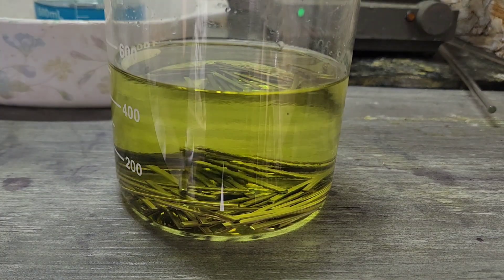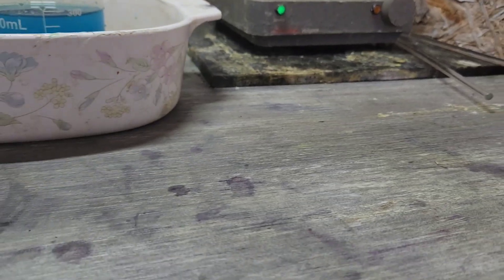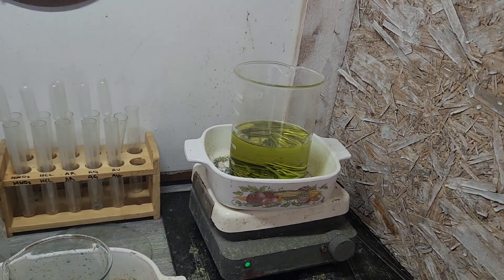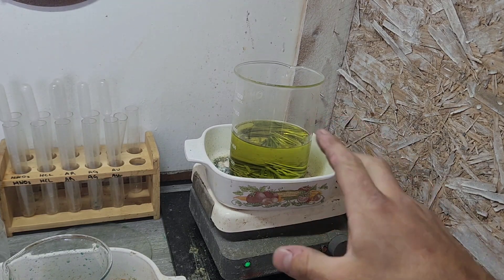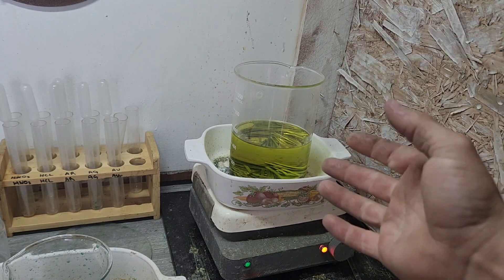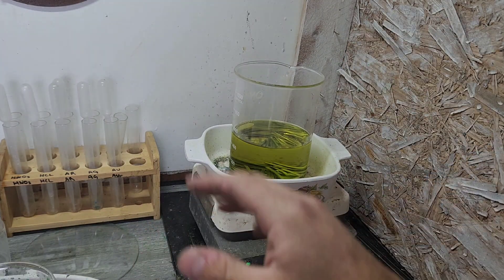I'm going to throw this on the heat. Turn some heat on and there we go — we'll let that eat for a little while. We've got quite a bit of base metals in there and we're going to try and remove those before we even attempt to put nitric in to refine that silver. So go ahead and let her rip.